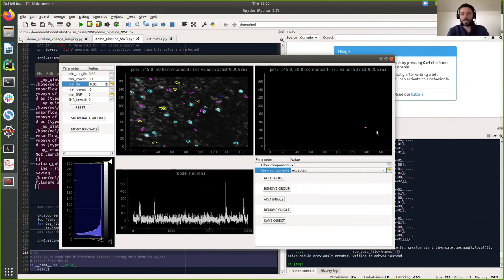So for the right part, on the top right, you can see what the neuron looks like. And on the right bottom, you can manually select which neurons you want. For example, I think all of them are good. I can add group. And now it's in the accepted. And if I think this neuron looks not good, I can remove it from accepted list. Now it's in the rejected. And finally, we can save the object. Either in HDF5 or we can save it into NWB. And we can save the result. So I think that's basically what I want to show you guys, the pipeline, its communication with NWB and the GUI. So thank you, Changjia. I don't know if there are other questions.